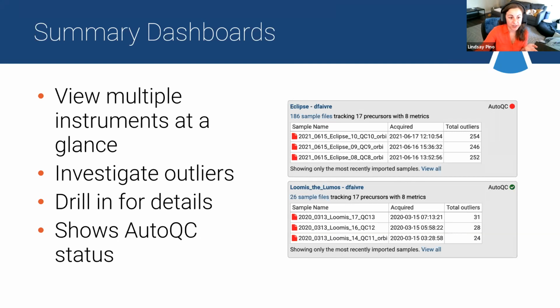So you could imagine these two examples that Josh is showing here. You can imagine this being the same instrument, but two users. I've seen it done both ways in the various labs that I've been in. It's nice to get the longitudinal look at a single instrument's performance over time. So if it's switching different types of columns, like actually different packing material and different column lengths, maybe making that each their own QC folders.